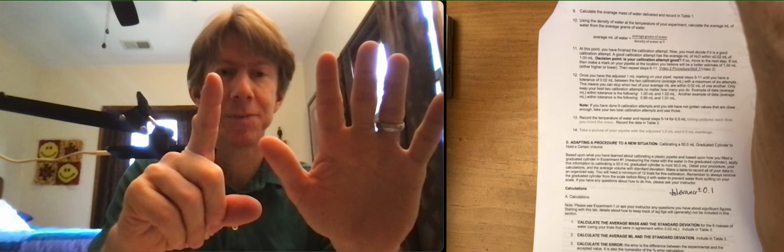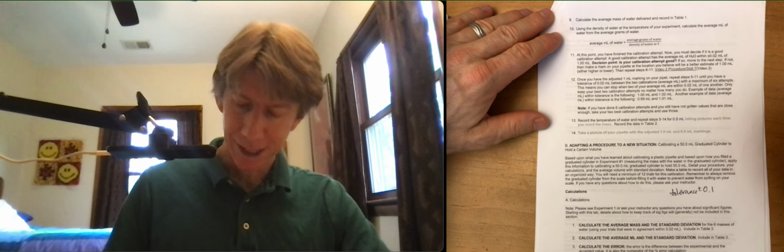Let's see. And you will need six good measurements, just like for the 1 milliliter and the 0.5 milliliter calibrations that you've already done. Only six measurements. If I see you, six good measurements, so maybe it'll take nine total, but six good measurements. If I see you with 9 or 12, and they're not because you went through the flow chart and did exactly what we just did, I will wonder what your process is.